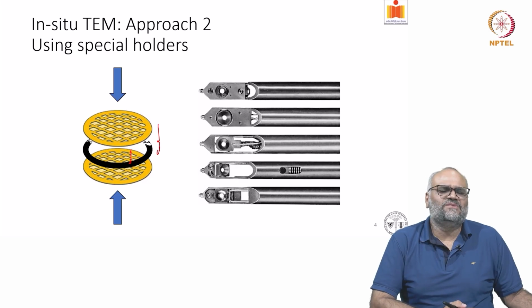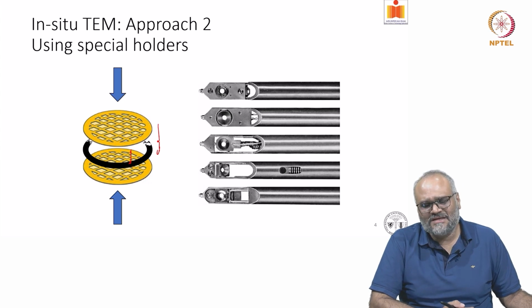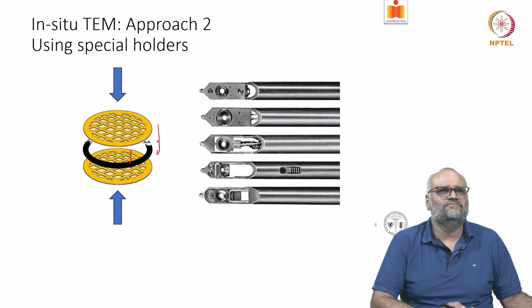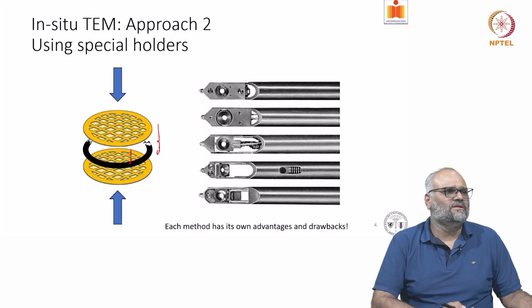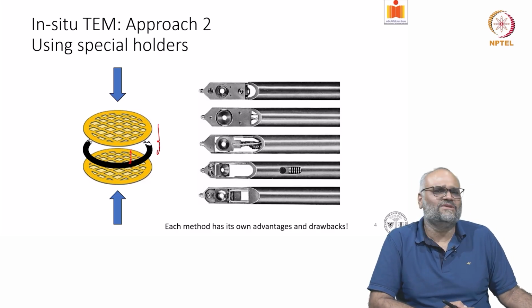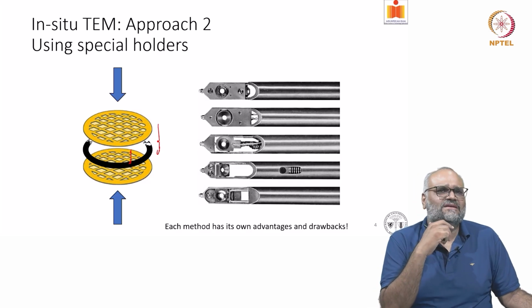So both the methods, whether you're using environmental TEM approach or a two half holder based approach, has its own advantages and disadvantages.